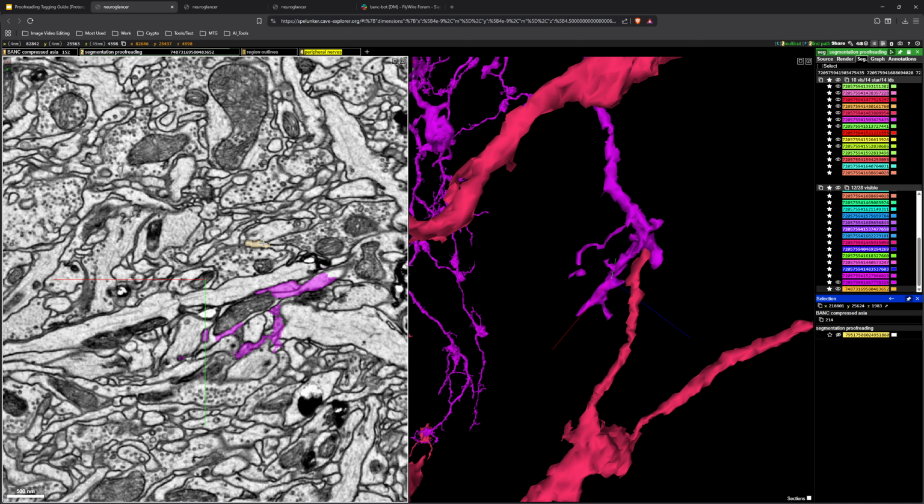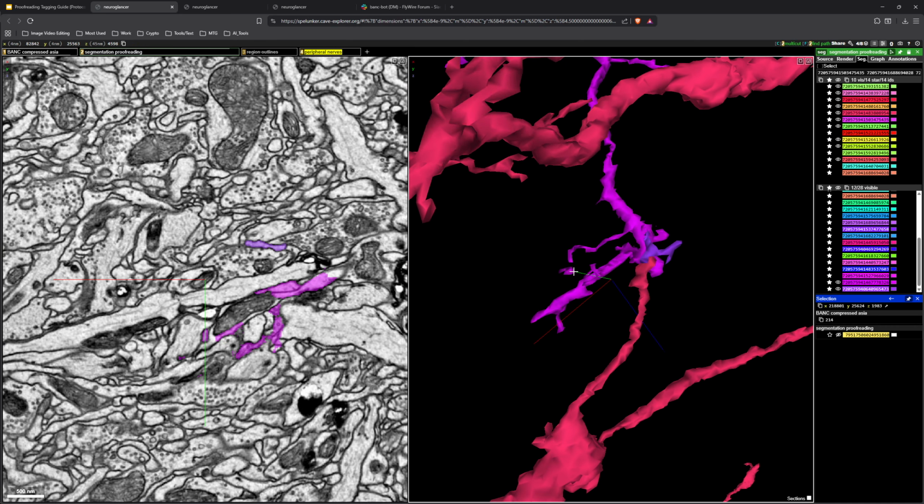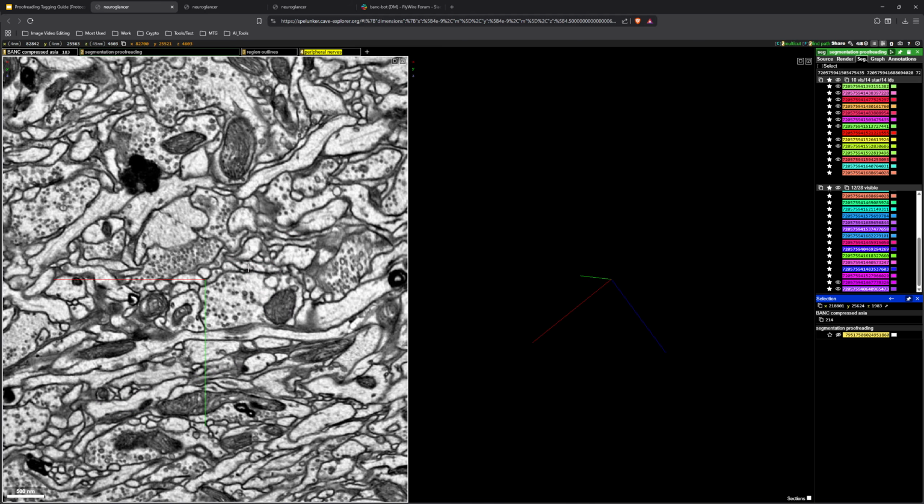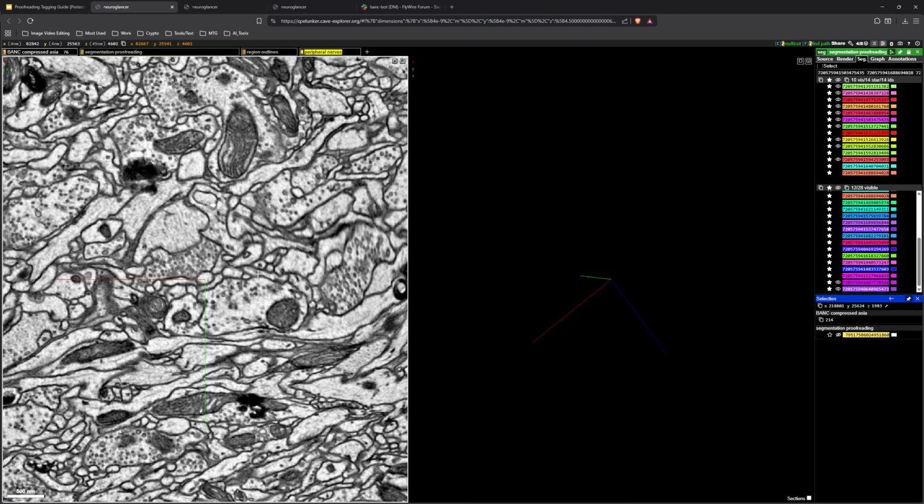And I believe this path might be the actual path. So let's take a look at that. As you can see from here, I'm looking at this mitochondria as sort of a guide. So our sort of pancaked cell here with a little bit of ER that just barely glides against the surface of this axon. And as it squishes down, it's hard to determine the difference between this piece and this, but this longer flat piece is right up against this piece.